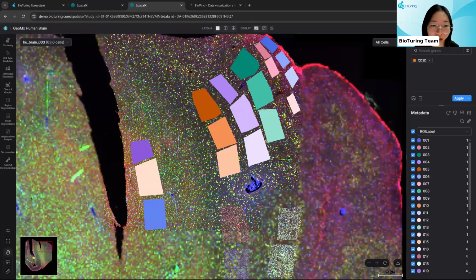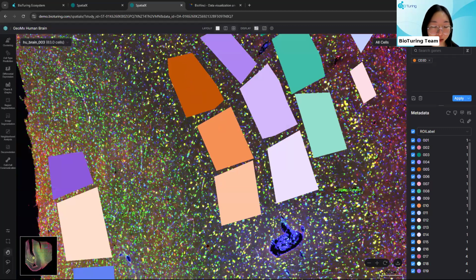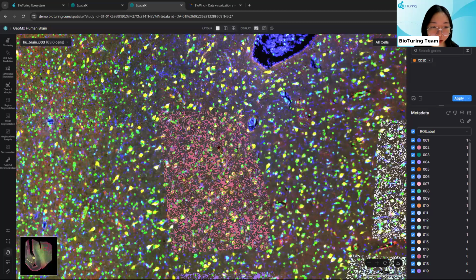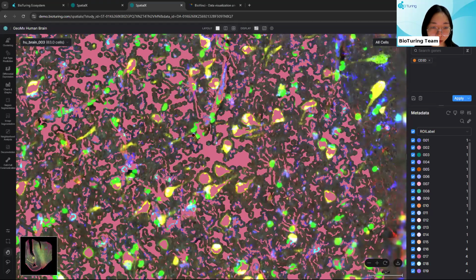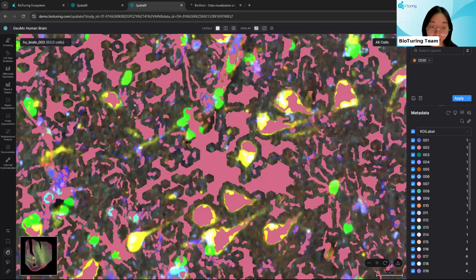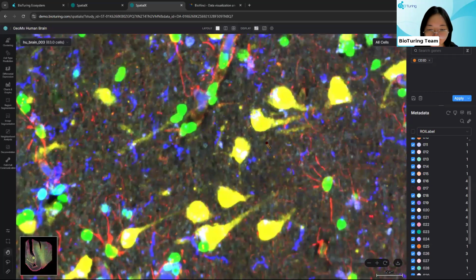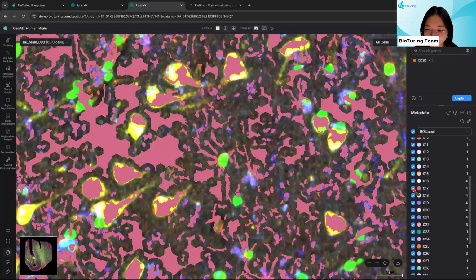There are multiple regions of interest which you can select on the tissue, and they can look different from each other. The region can be just a square like this, but it can also look like this. These regions are based on the fluorescence of the fluorescent probe. Each of these fluorescent probes will be a marker for a different cell type. If I were to hide the overlay on this particular region, you can see here that the overlay overlaps with the red fluorescence there.